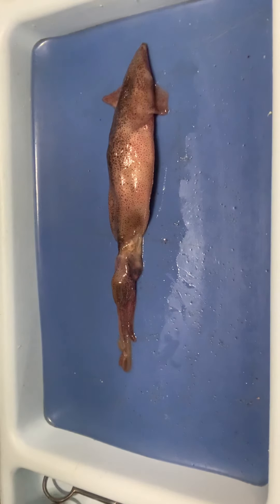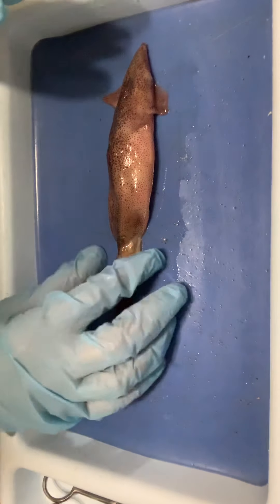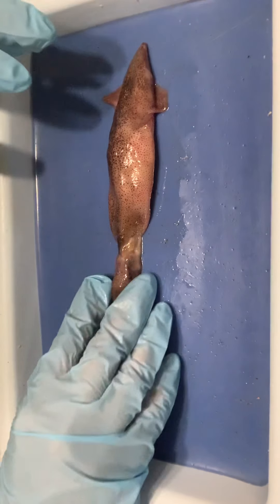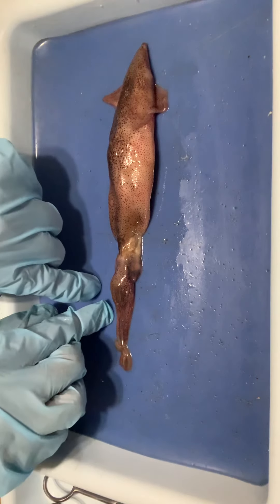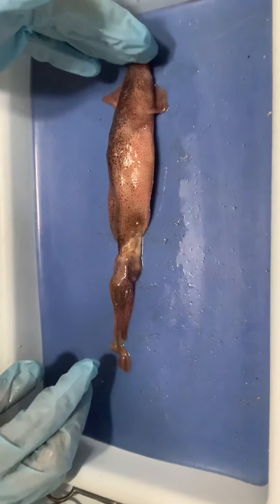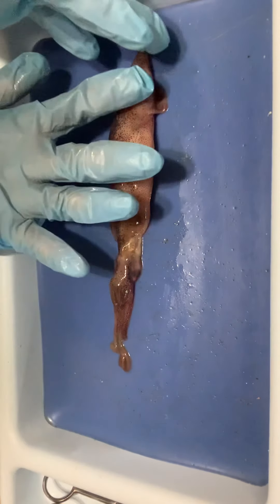In orienting ourselves, it's not what we would expect. When we look at it, the head-foot region is down here at the bottom, and we see the visceral mass region up here at the top. The head-foot region is actually considered the ventral part of the animal, and the top part up here is the dorsal part.